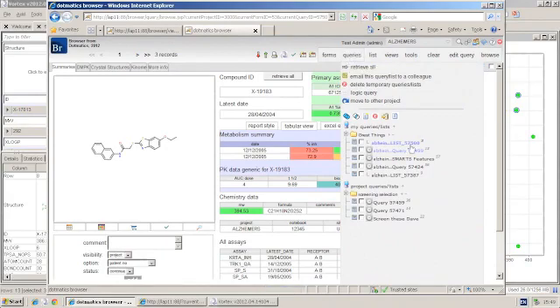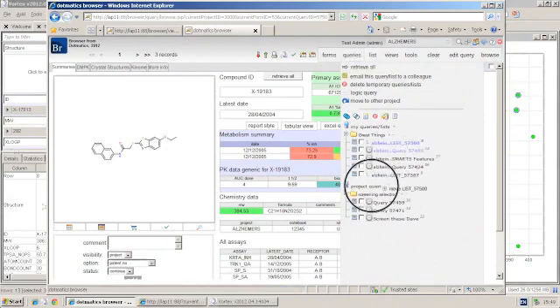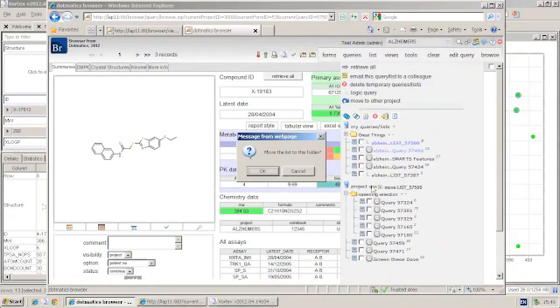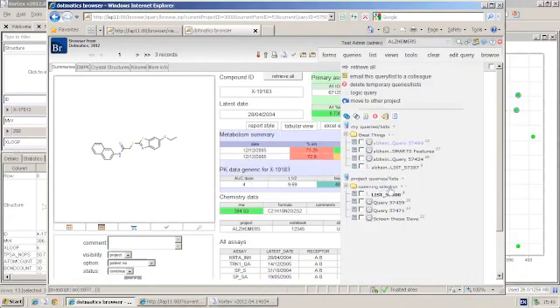I can then take my list and share it with the rest of the project team with a simple drag action, or I could take this list and email it to all my colleagues.